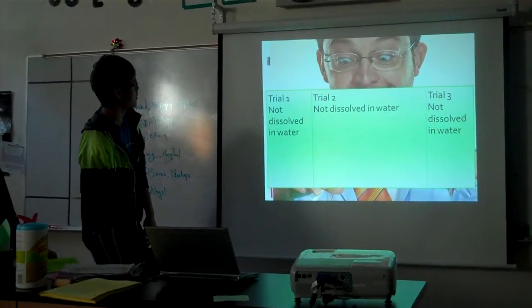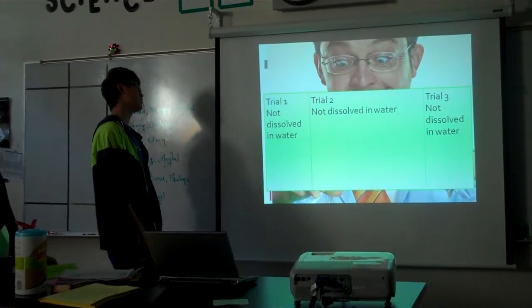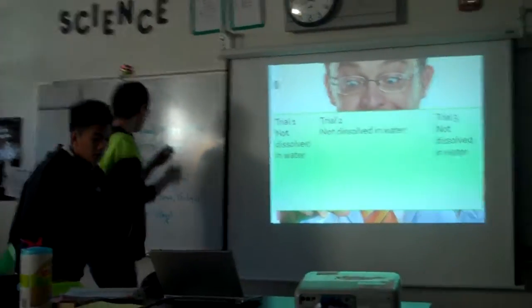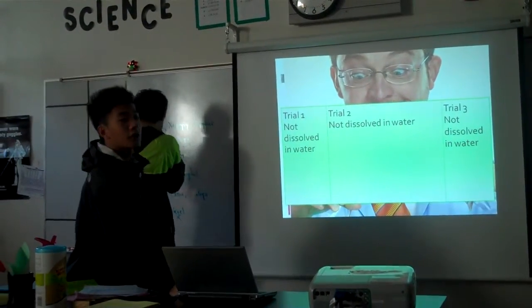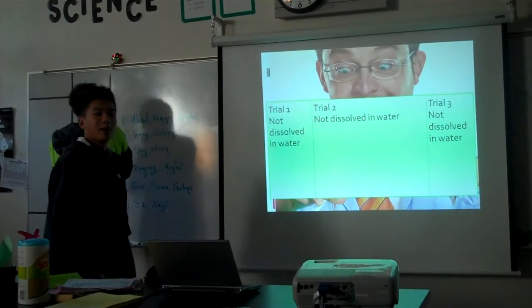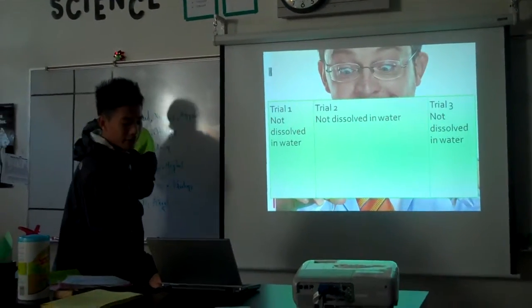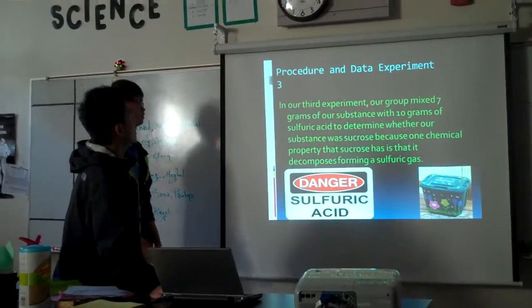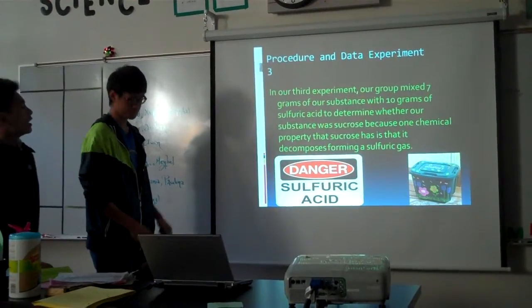Trial 2, did not dissolve in water. Trial 3, did not dissolve in water. So based on our observations, we found out that our substance does not dissolve in water. So here is our experiment 3.